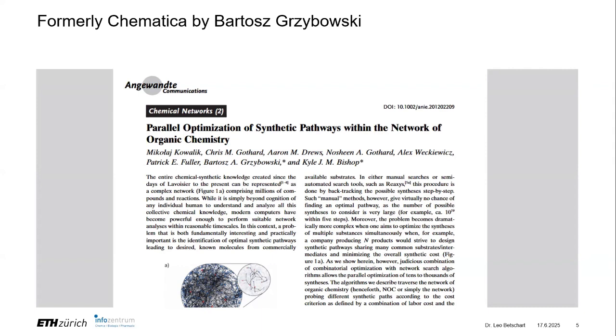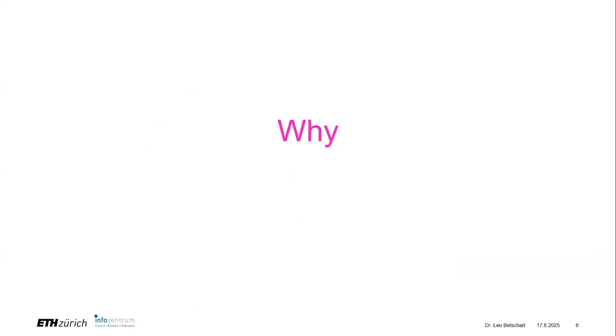And maybe the difference, because if you are a synthetic chemist and interested in synthesis planning, you probably have either worked with SciFinder or Reaxys. They have synthesis planning tools too, and those are based basically on the reactions that are within their database. Synthia is different, in that rules for chemical reactivity are encoded into the software. So there is a bunch of chemists in the background that create these chemical reasoning rules. And so here you will get slightly different results. If there are steps that are literature known, they will also be presented with literature.